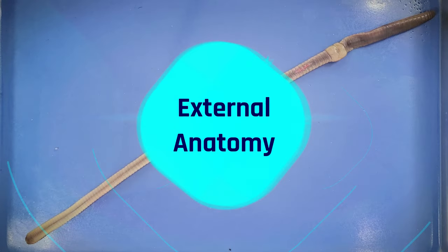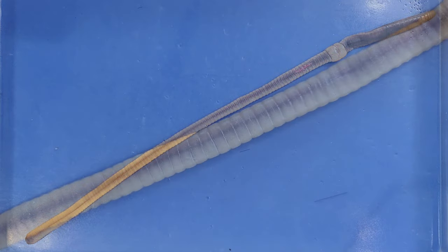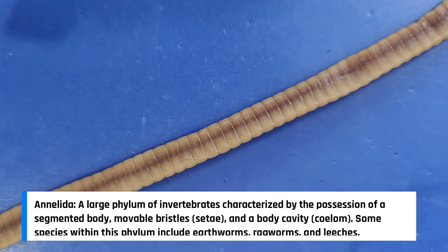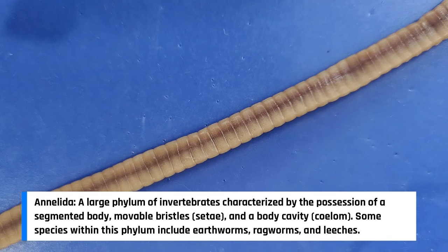So now let's take a look at the external anatomy. Earthworms are members of the phylum Annelida. The word Annelida means ringed and refers to a series of ringed segments that make up the body of a worm.